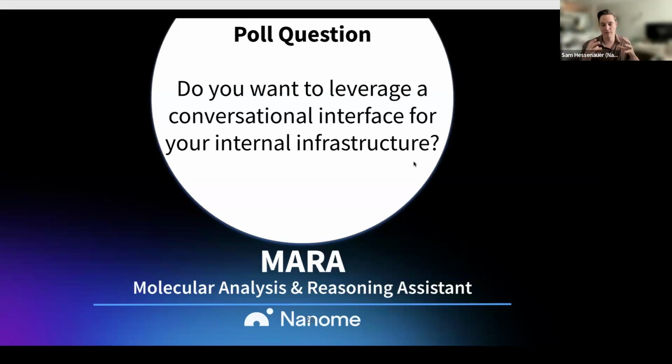So a lot of where we see things going is, I ask for information about the binding site. It already suggested a visualization for the binding site being highlighted on the actual molecular visualizer. So those are some key areas there. We have a lot of things that we're working on, but those are some big two that should excite everybody.